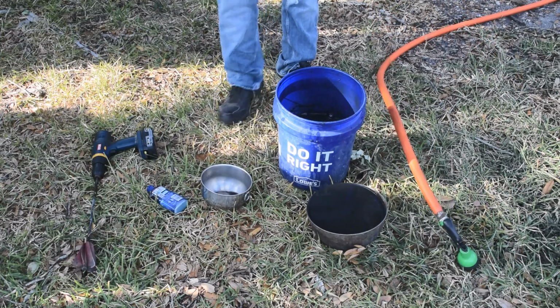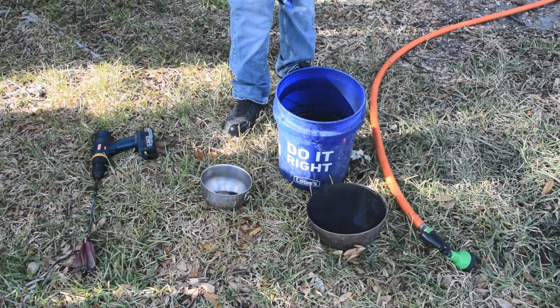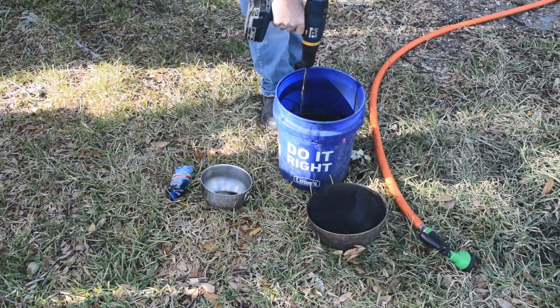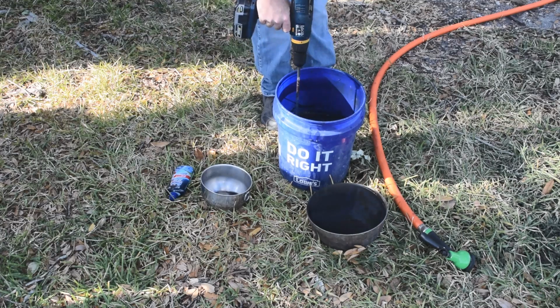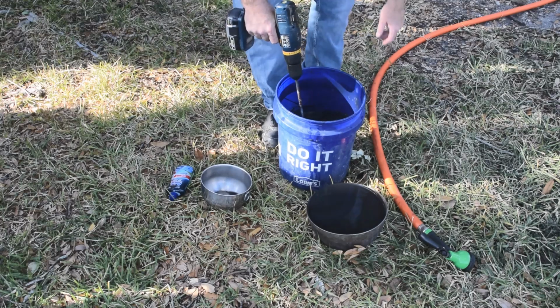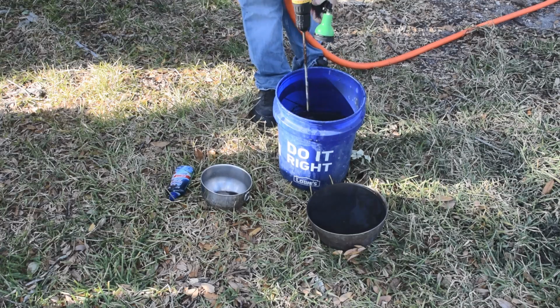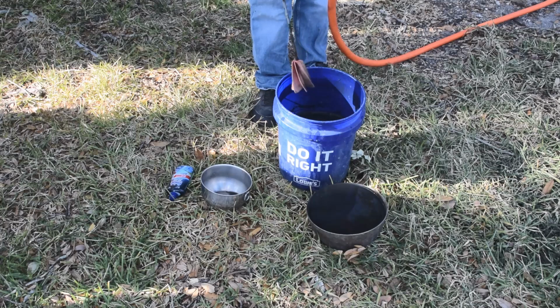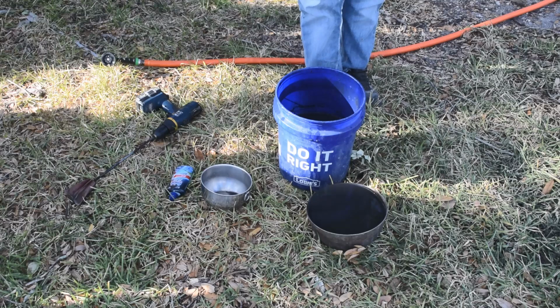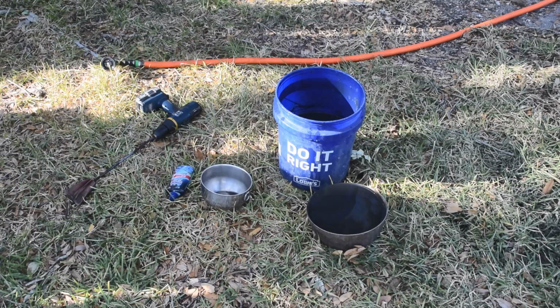Okay, that looks pretty good. Got another little sheen of oil there, not as bad as last time, but there's some. In goes the Jet Dry. And we're going to stir it up again. All right, so just for the sake of consistency, I'm going to wait another 5 minutes, although I think it's a little long in this case. And then we'll see. Maybe I'll start cutting it back to 3 minutes after this time.